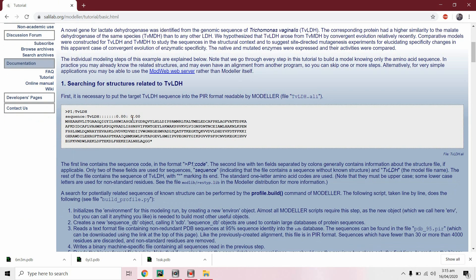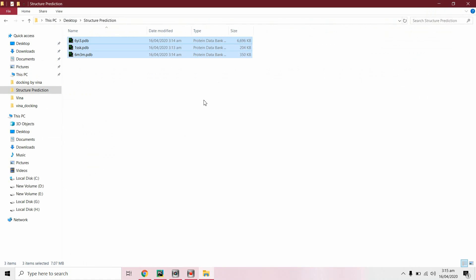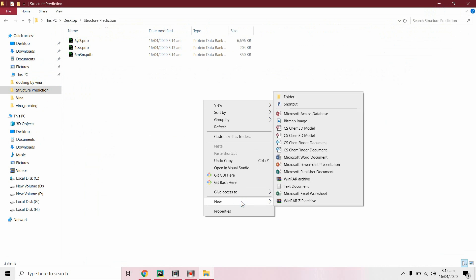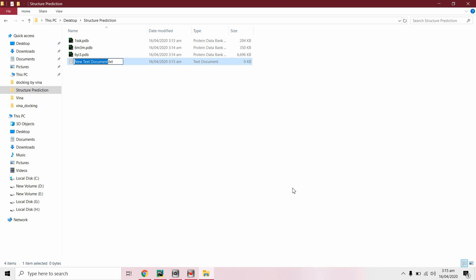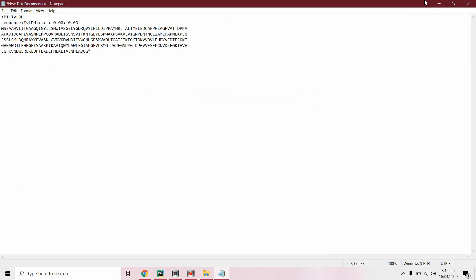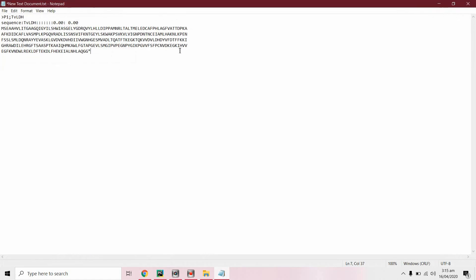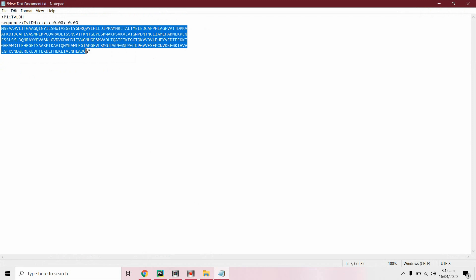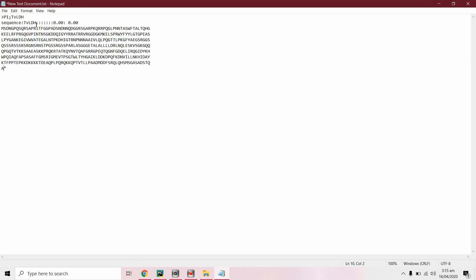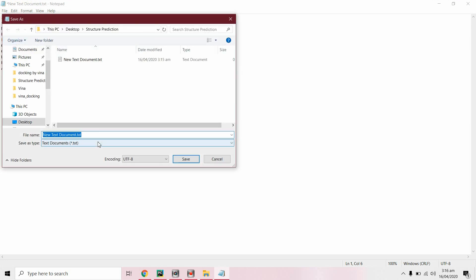We will have to save our target protein in the .ali format. Select the target protein sequence and paste it here. Select its name — it is the nucleocapsid protein. Now save the file with the .ali extension.